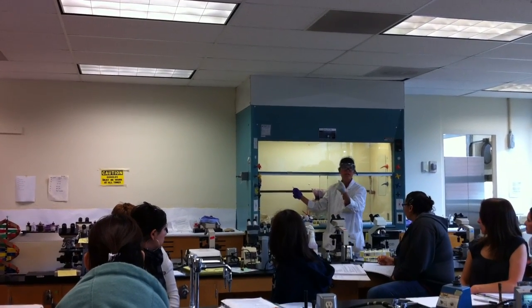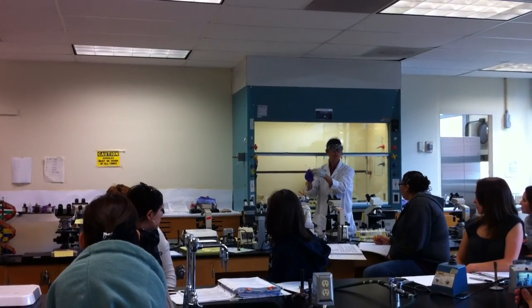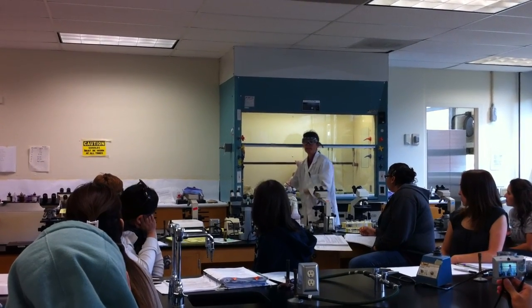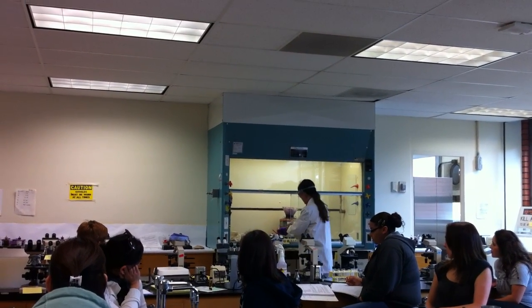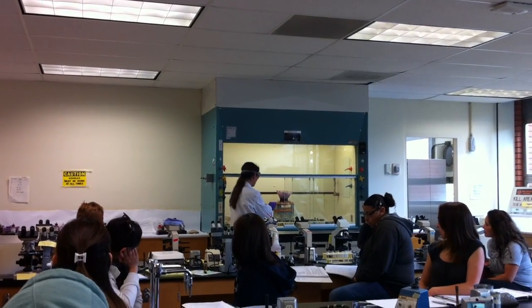Don't continue to grind it, because you'll make tiny glass particles that will plug the dropper tip. So one crunch, and then you want to tap it, and that will bring the glass particles away from the dropper tip. Then I'm going to add my alpha naphthol to my first tube.